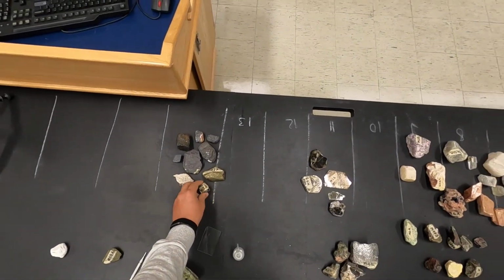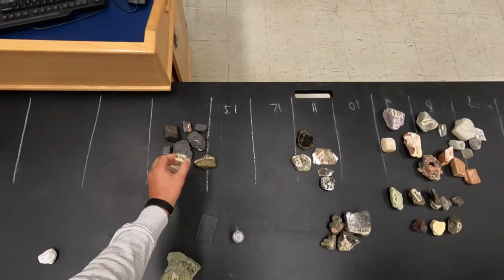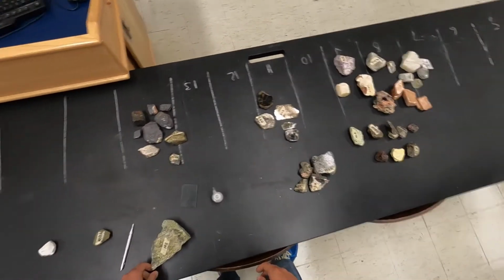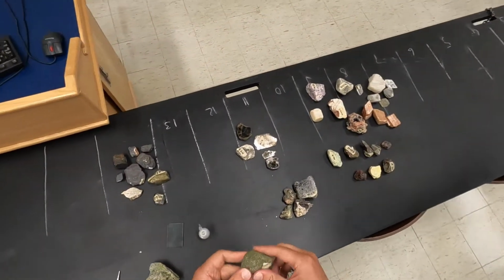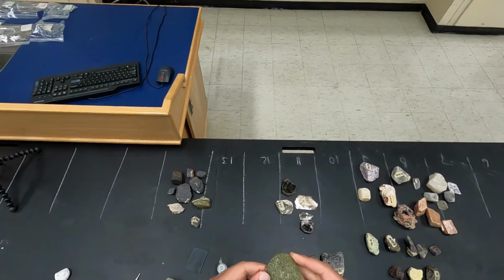can identify it. And definitely it is an opaque mineral, or it could be very close to an opaque mineral. It depends really on the composition in this particular case. We are close to other important minerals. This one here has a characteristic greenish color, and it's quite translucent.